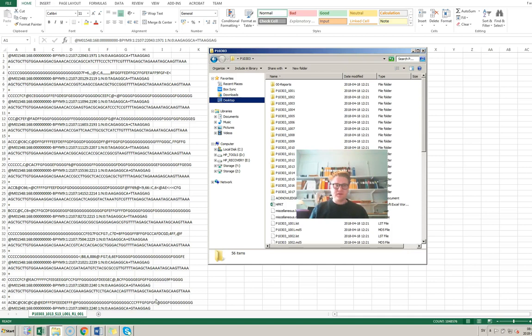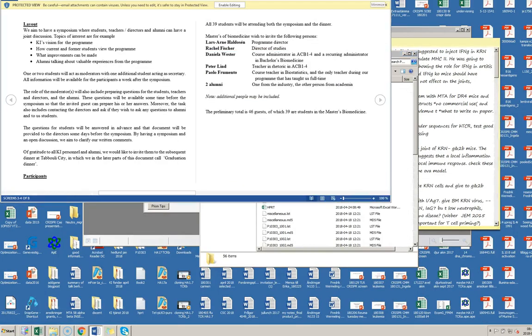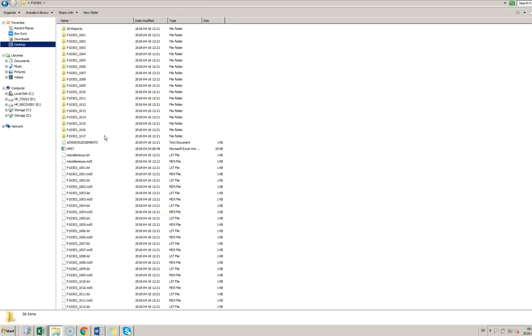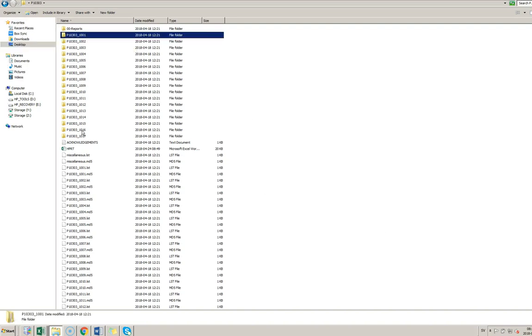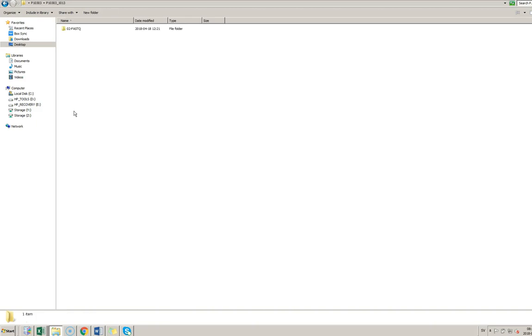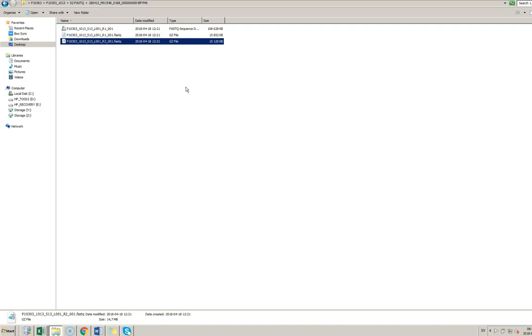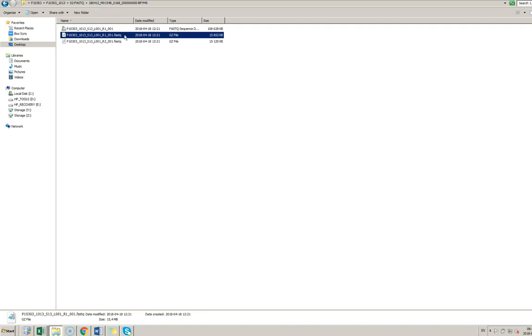So what we have here is a next-generation sequencing data file. This is 17 samples containing FASTQ files from a MiSeq run, taking plasmid and cells at different time points during the CRISPR screen — PCR amplifying the gRNA sequence and then sending it for a MiSeq run using Illumina indexes. Each sample contains a forward and a reverse file, and we're doing 2×75 base pairs.